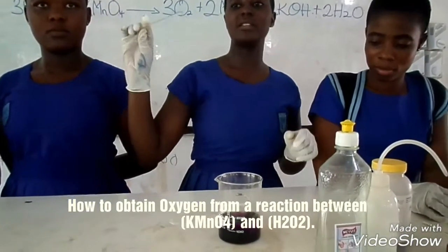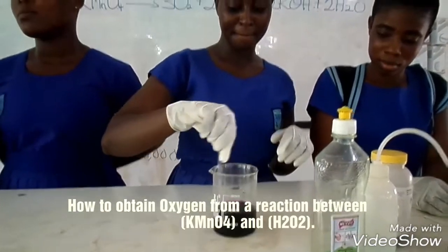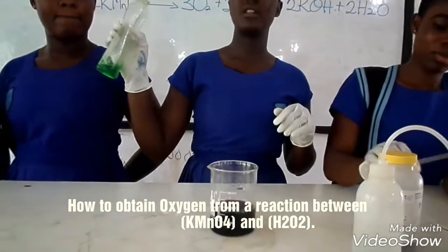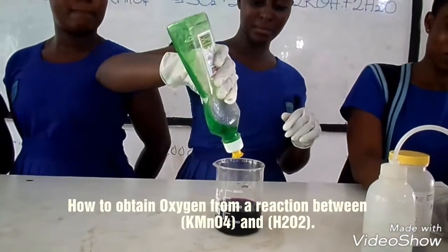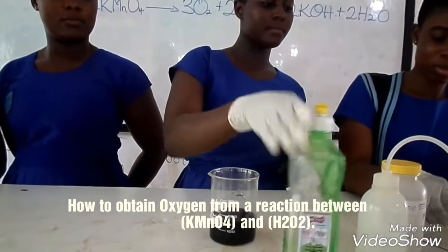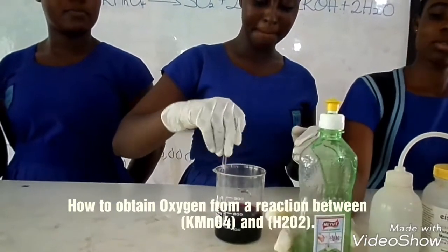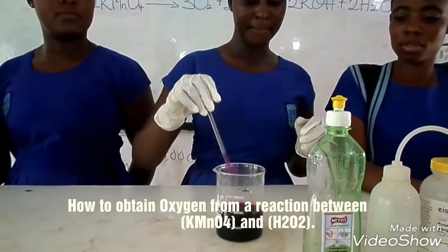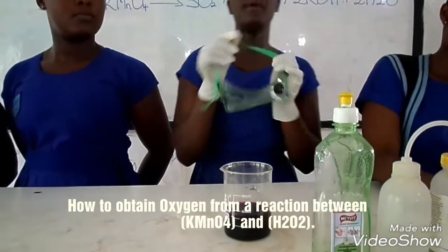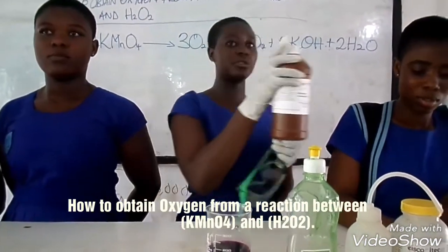You will stir so as to get a uniform mixture. Now I will put on my goggles because the hydrogen peroxide is very dangerous.